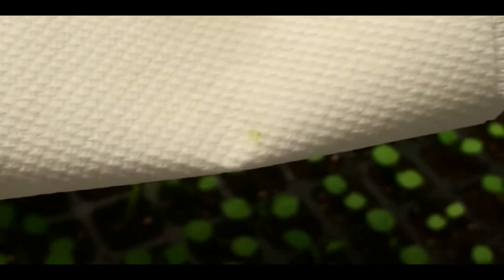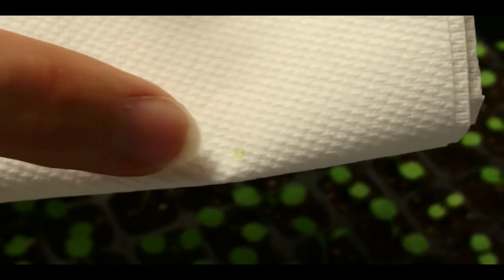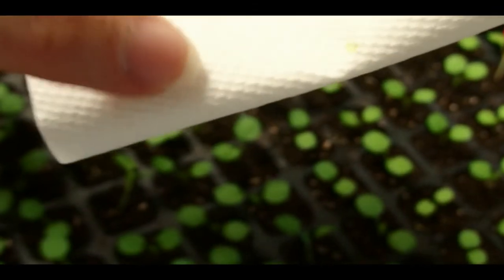If you want to see whether you have liquid in your well, you might hold it up to the light, or you may put it against a black background. Go ahead. And you can see here that that area right there is where she punched against. She's pointing at it. It's a little bit green, so you're not going to punch against that area again. I'm going to move down the paper towel. Okay. All right, let's go ahead and do this whole row.